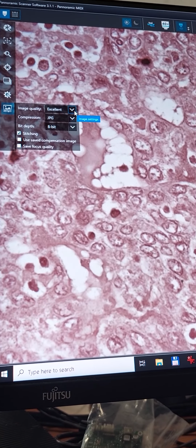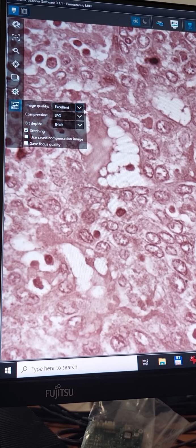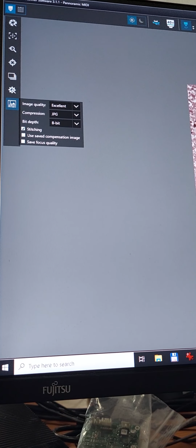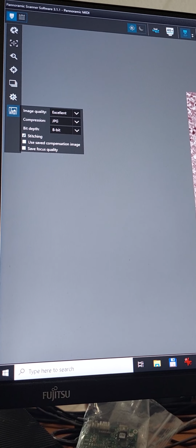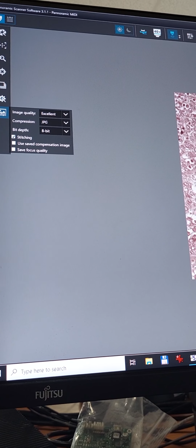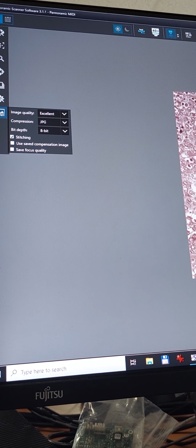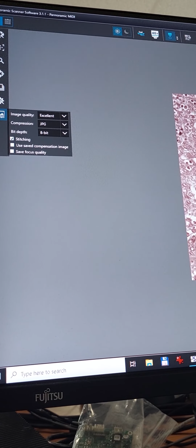Okay, that is already really good, and you will have manageable file sizes, because imagine that, for example, I image this whole tissue, which is not very rare, whole tissue in 3 layers. That's a really big file. So if I did not apply any kind of compression, it is going to be really big, while the quality is not going to be that much better, because 90% JPEG compression reduces the size very much already, while the quality is quite the same, really good.